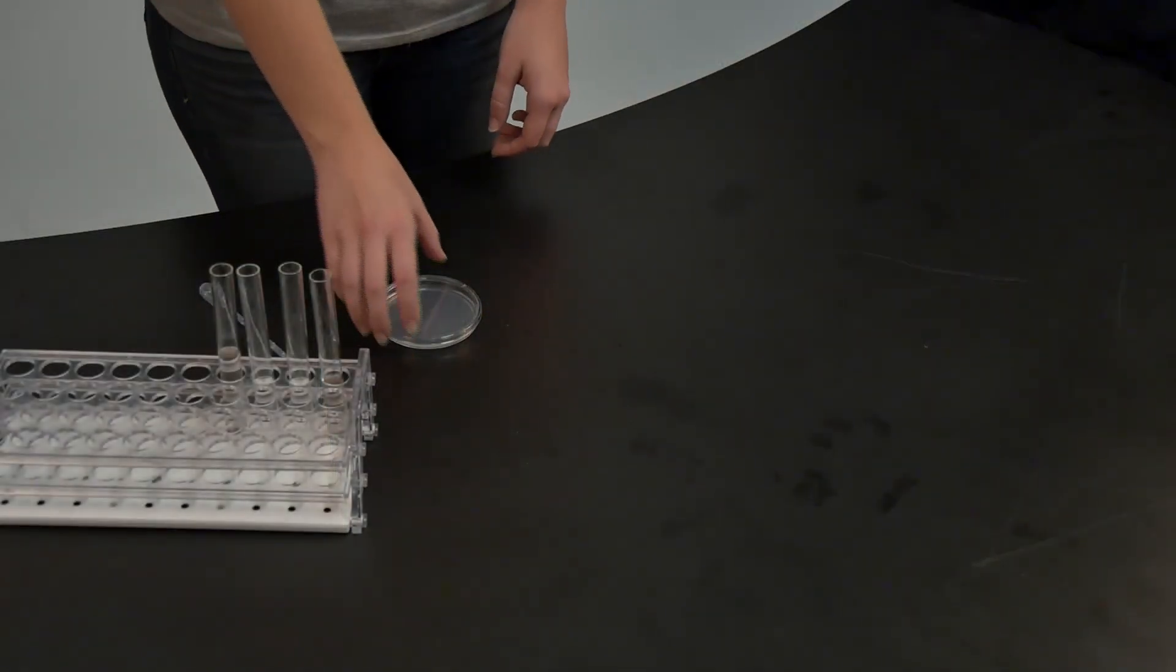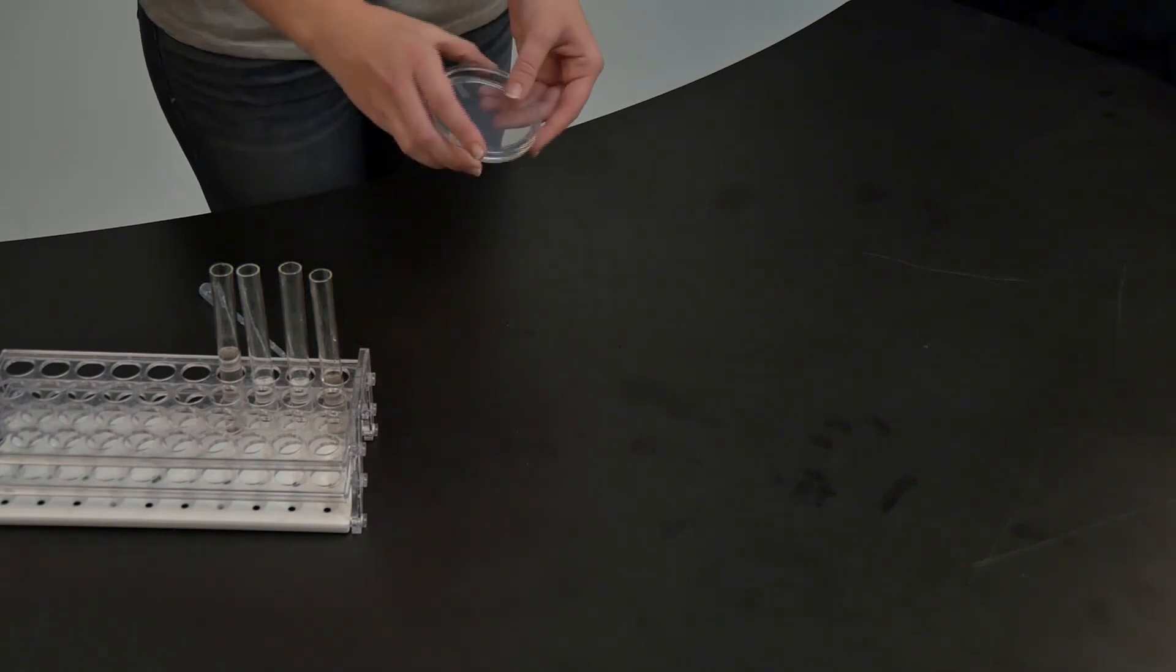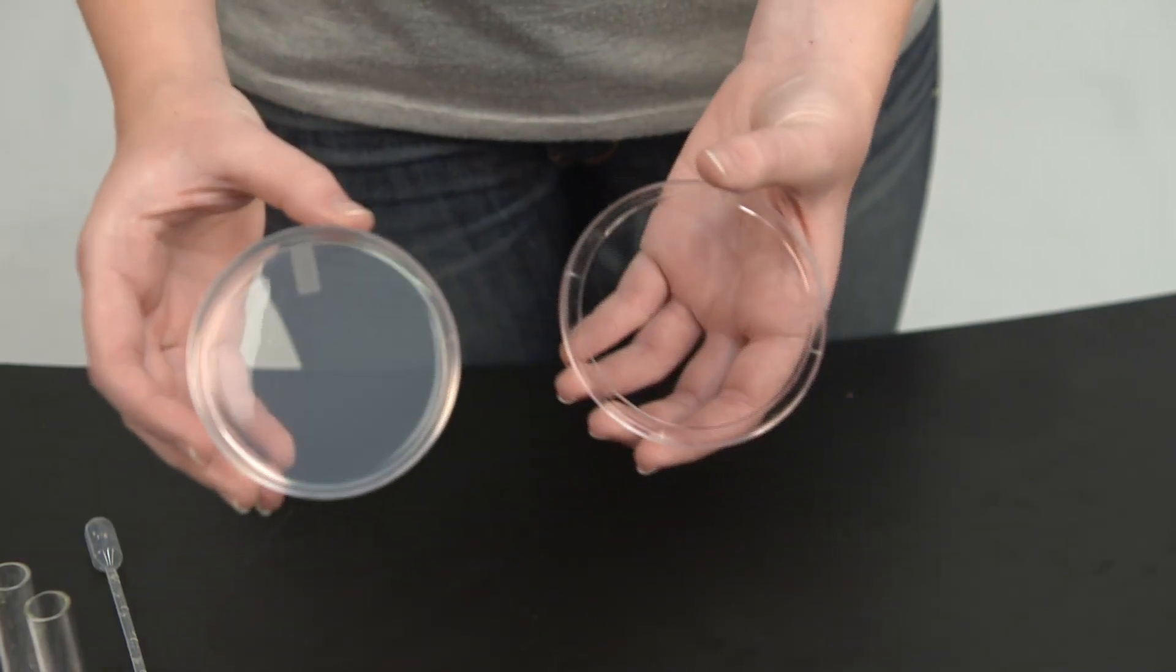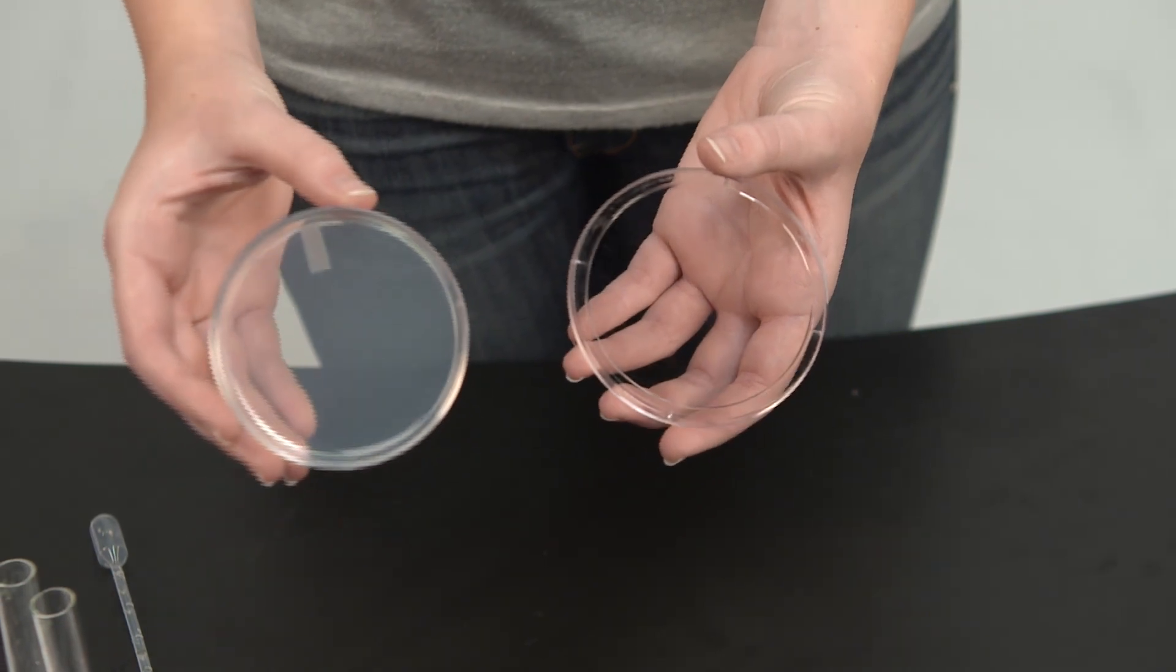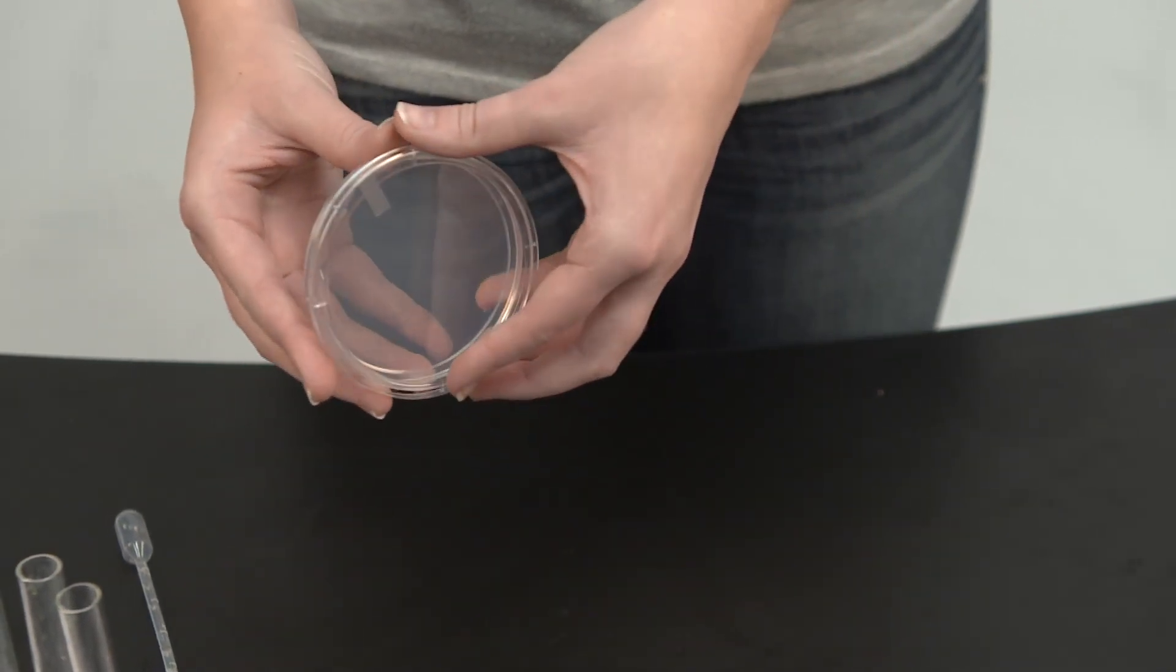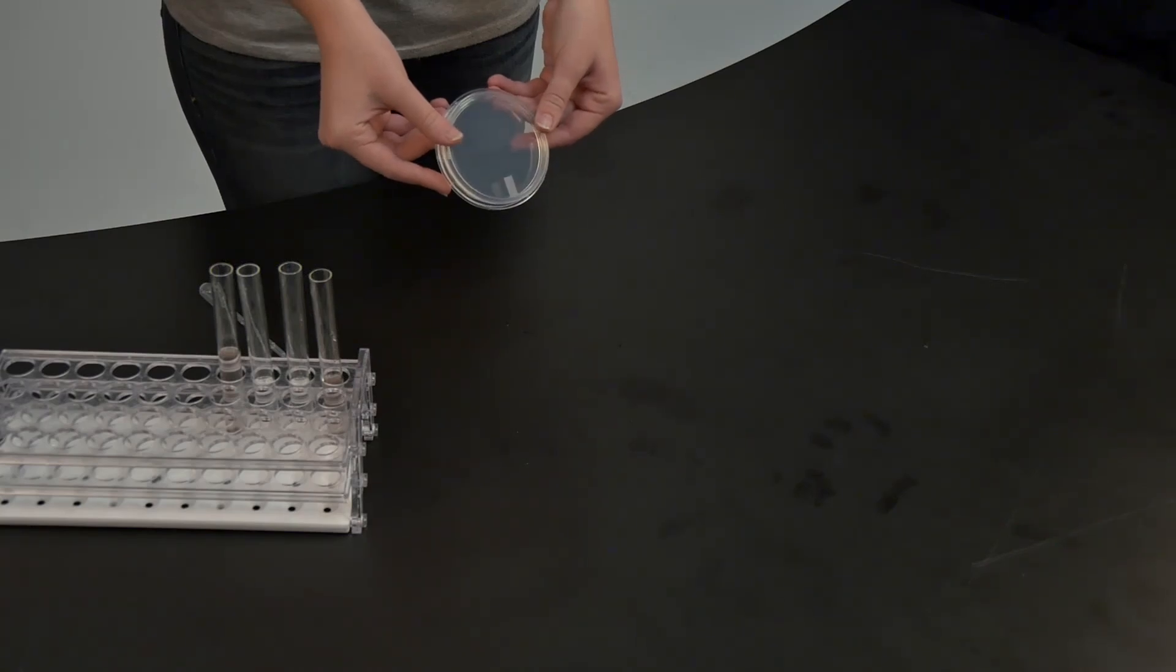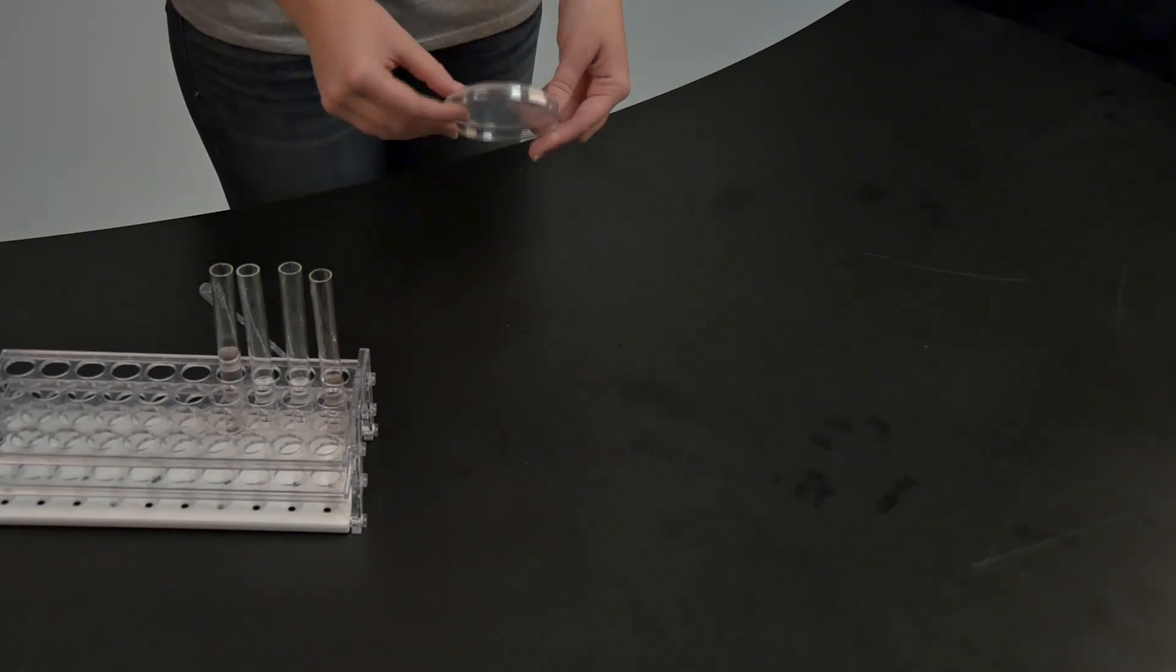The next step is to transfer this solution onto a petri plate. A petri plate is made up of two parts, the plastic lid and the bottom that contains the nutrients. Remember that bacteria need nutrients in order to grow. You'll want to make sure that the bacteria are spread on the bottom of the plate where the nutrients are found.